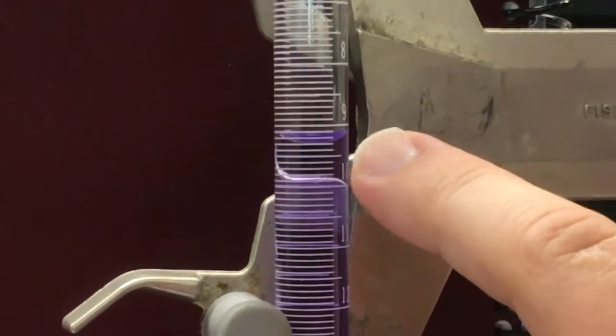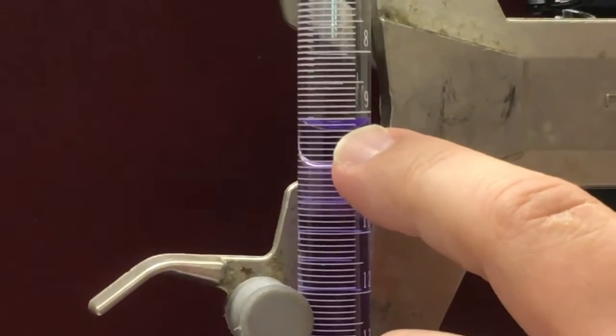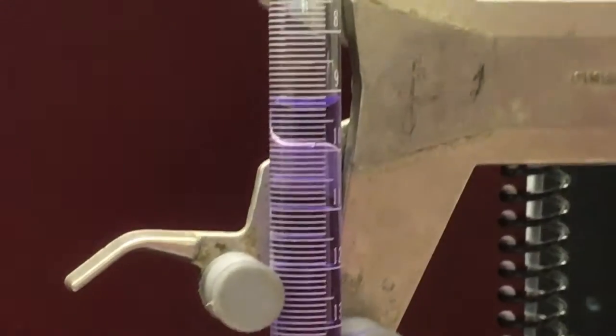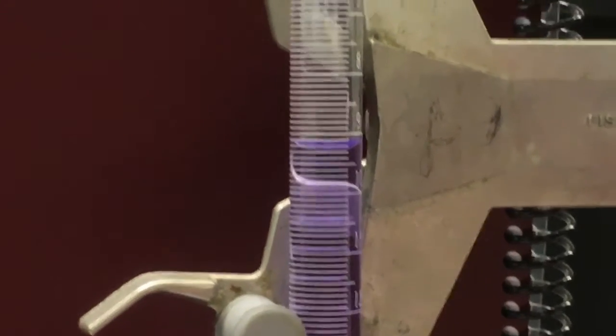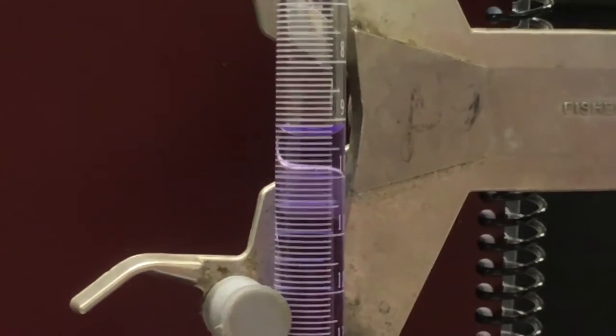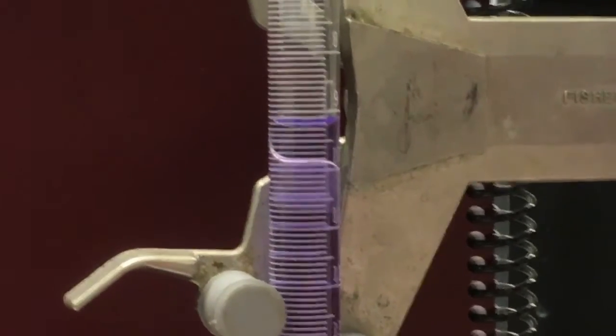The meniscus is definitely past the 9.1 line and past, I think, the 9.2. Looks to me like it's a bit shy of the 9.3 line. So I'm going to call it 9.25 milliliters as the initial level. So I will write that down as 9.25 milliliters.